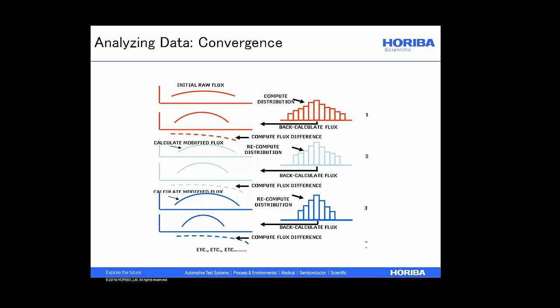Well, you noticed I mentioned before that we can calculate the scattering from individual particle size, and then we just add it up to figure out the scattering pattern from a mixture of particles. So how do we take a scattering pattern that we measure and find the particle size distribution? There are various numerical approaches.